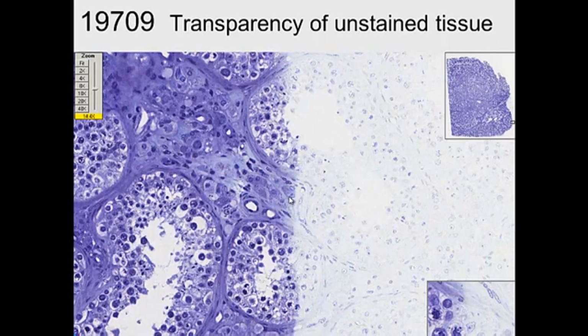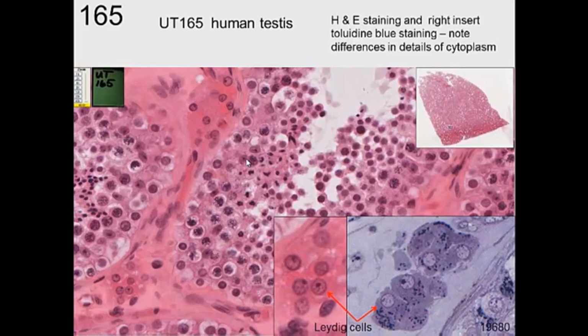Now, just to illustrate the fact that tissue is transparent, and you have to stain it. The reason you stain it is to stain it differentially, so you can see some different components in there. But as a rule, tissue, if it's not stained, is transparent. For example, we're looking through the cornea of our eye, and if it wasn't transparent, we wouldn't be able to see through it. But mostly tissue, unless it's specifically pigmented, is transparent, and you have to stain it to be able to see it. Also, this staining facilitates you to observe cells, but these cells are all dead. So they're dead already. And we're using bright field microscopy to observe stained cells. If you want to look at live cells, you need to use phase contrast microscopy or differential interference contrast microscopy, a different type that we're not using.